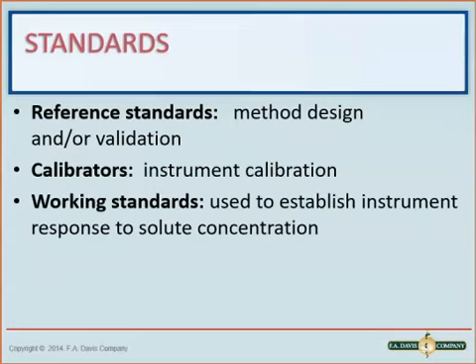Our working standards are used to establish instrument response to solute concentrations. These are similar to our reference standards, or sometimes those can be used interchangeably. These would be standards of known concentrations. It could be a set of standards, and each standard would be of a different concentration, but a known concentration.